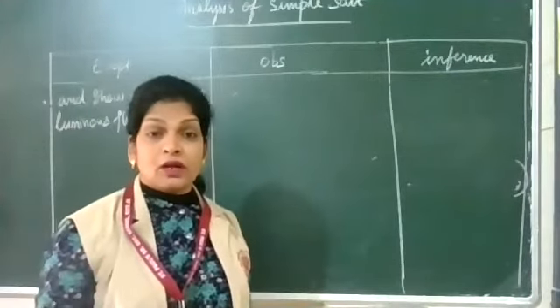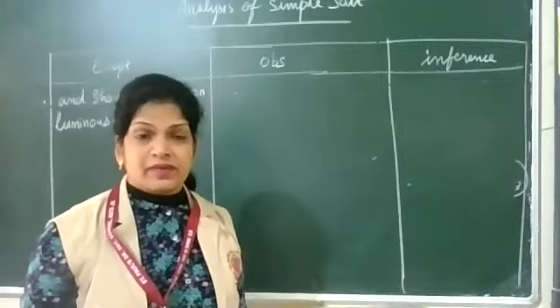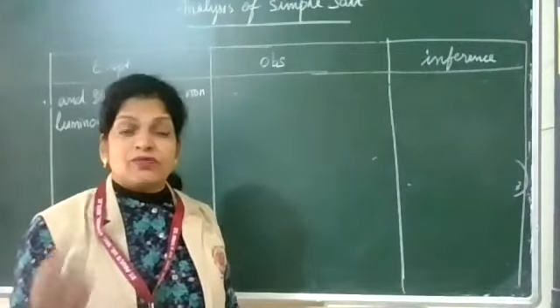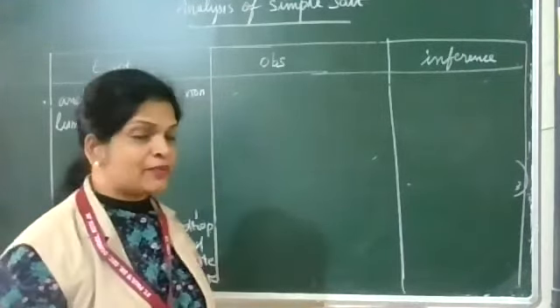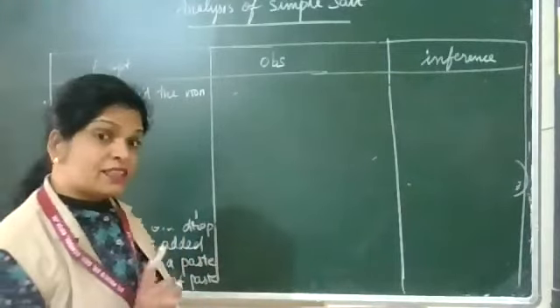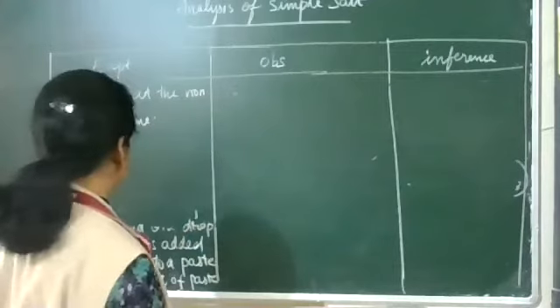If it is a yellow flame, it means carbon particles are catching fire. When carbon particles are present, you get a yellow flame. We call it a sooty flame, S-O-O-T-Y. Non-luminous flame means blue flame, a clean flame.